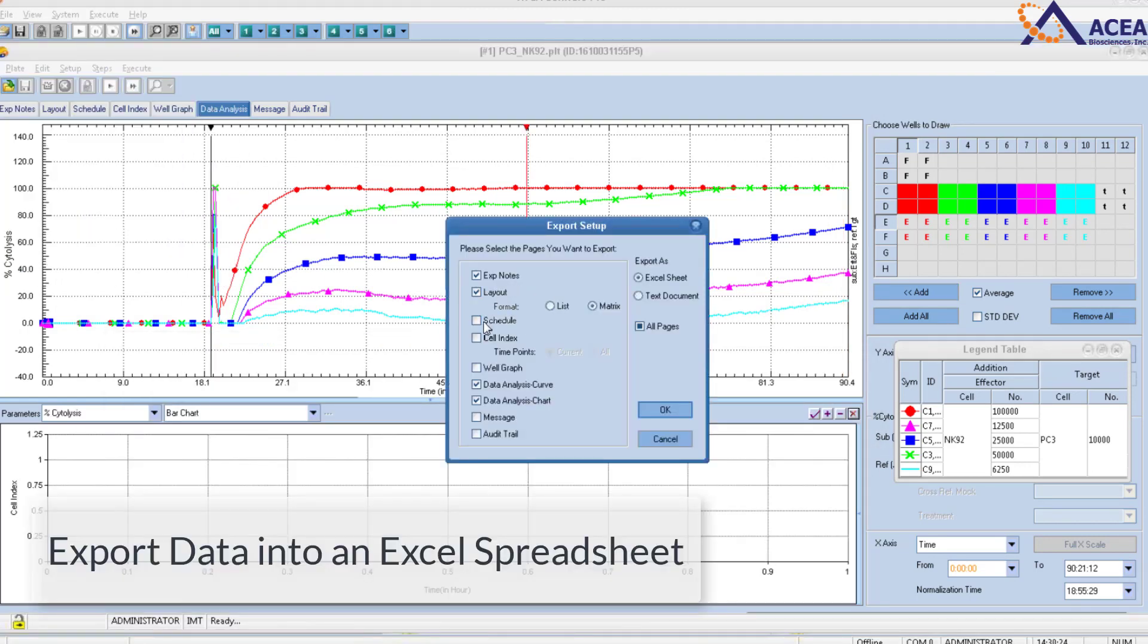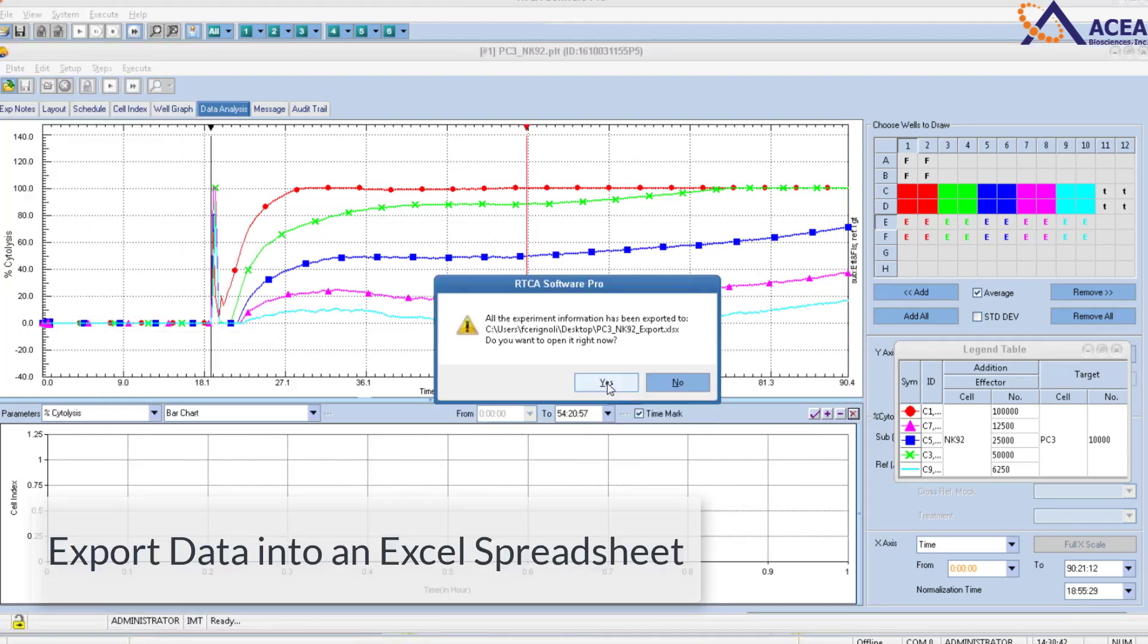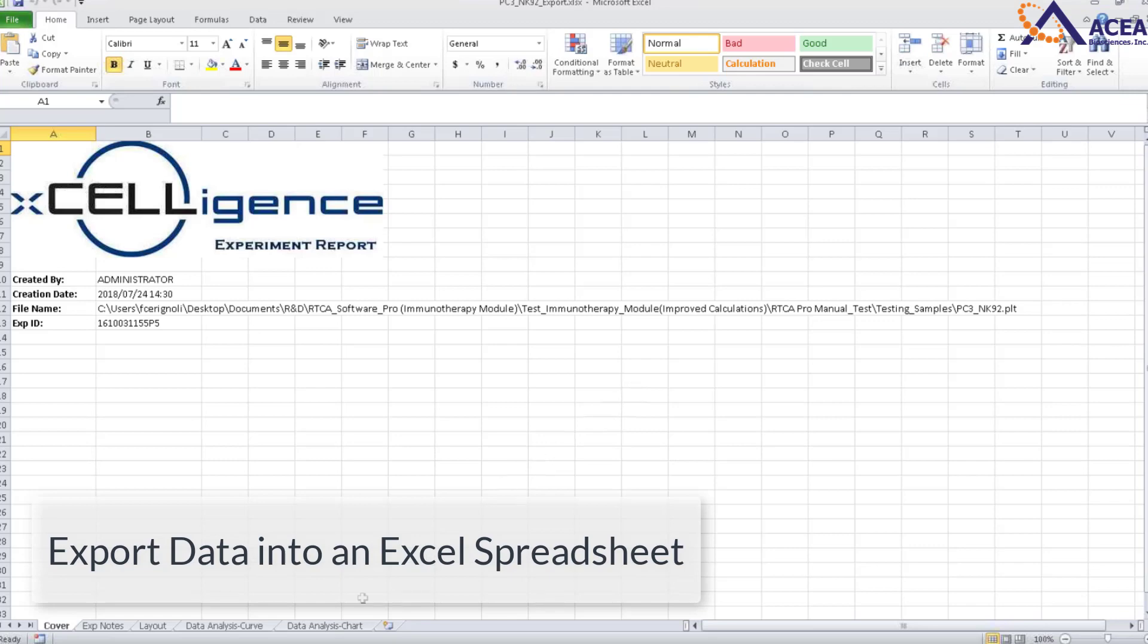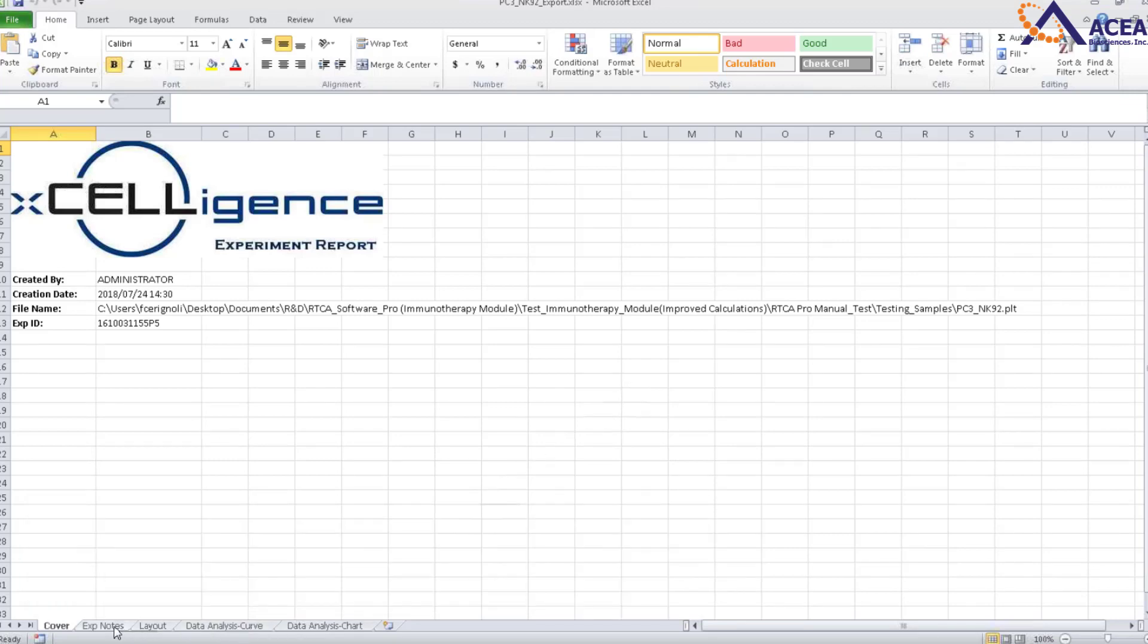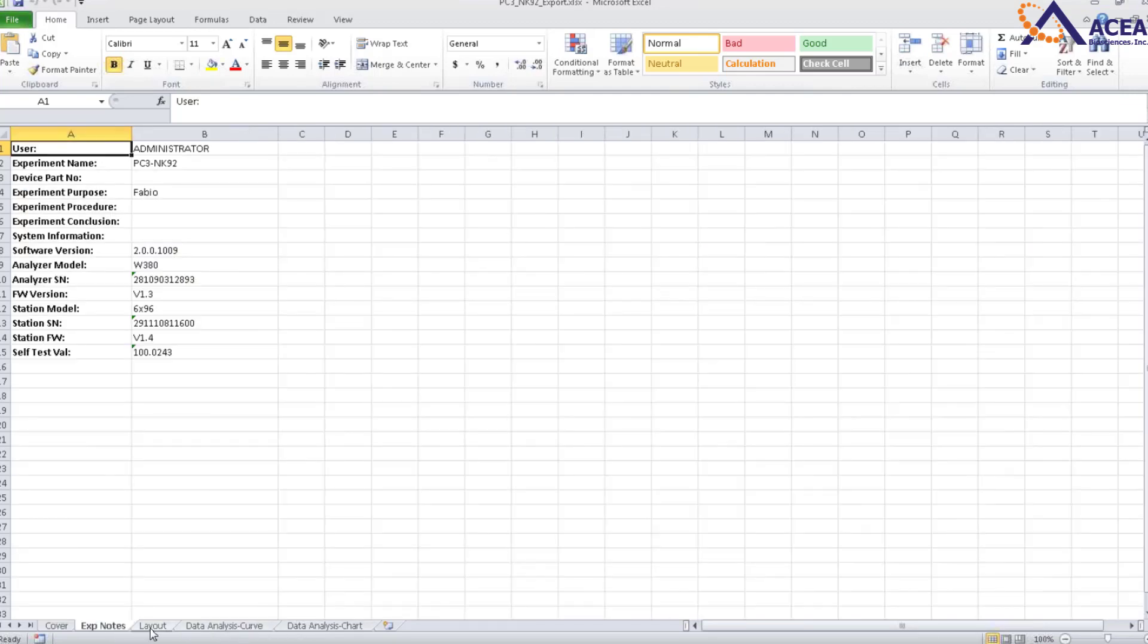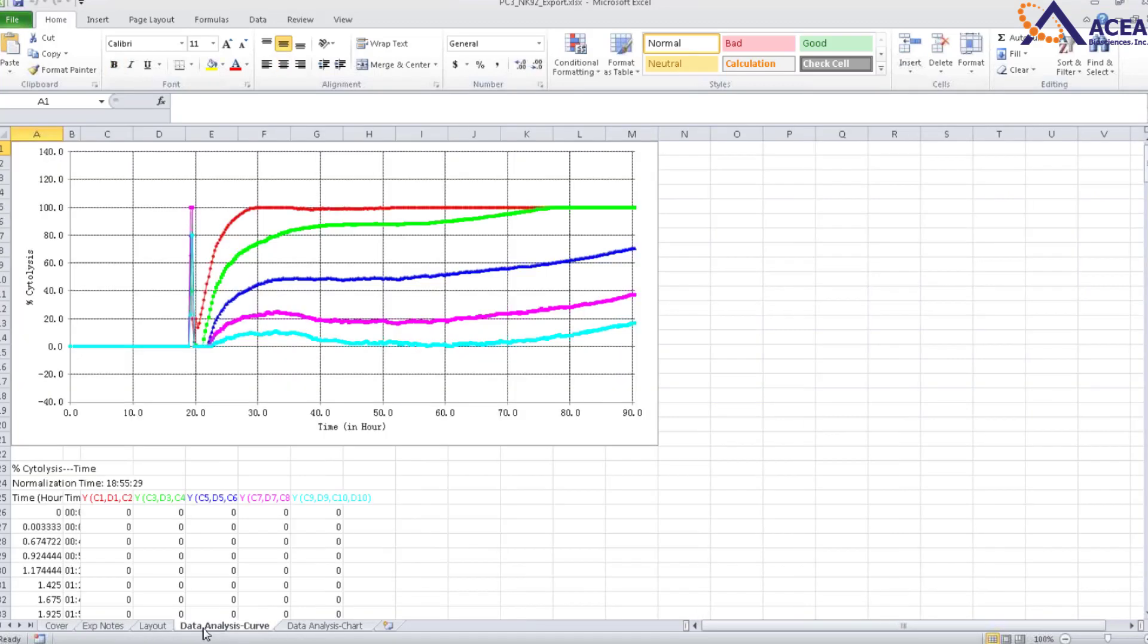To export data into an Excel spreadsheet, use the export function. Each tab shows raw data that can be used for further analysis.